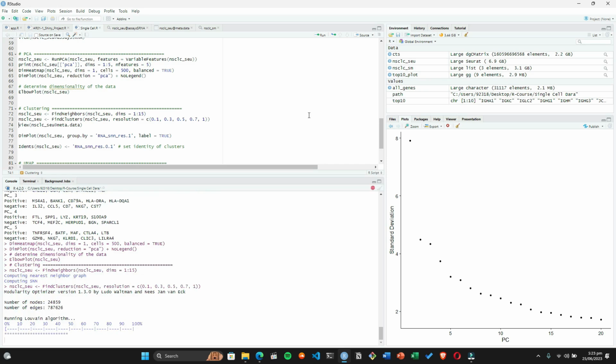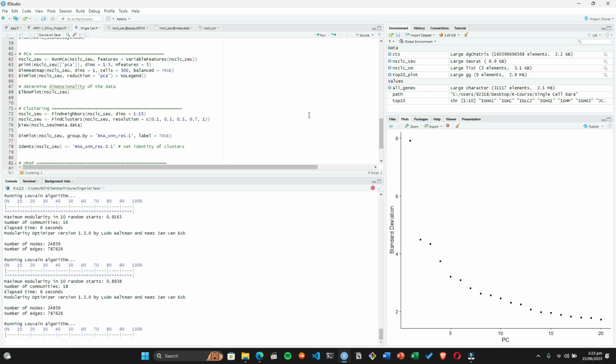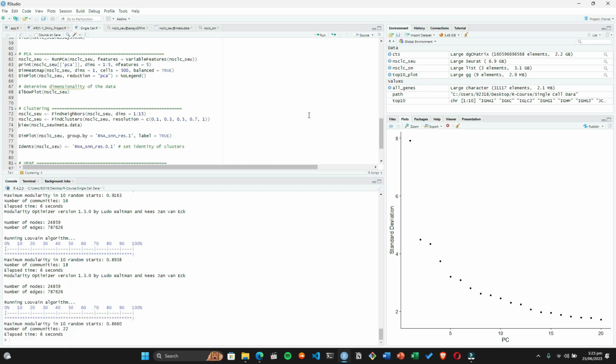So now that PCA analysis is being done, we are just two processes behind completing our single cell sequencing analysis. You can use this code from my GitHub account and then use any of your files to create your dataset and use it for the single cell sequencing analysis.